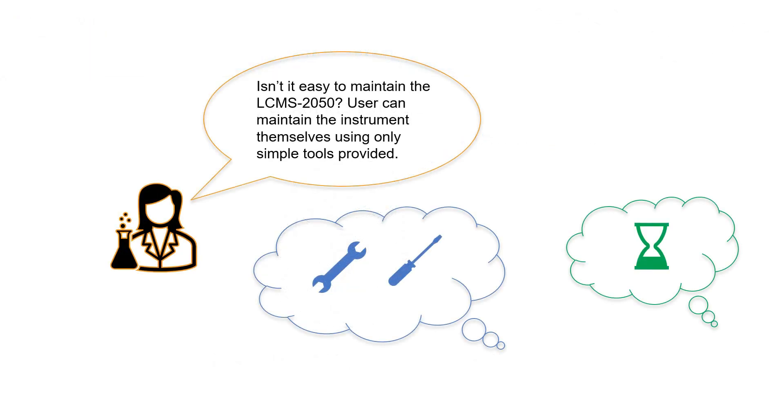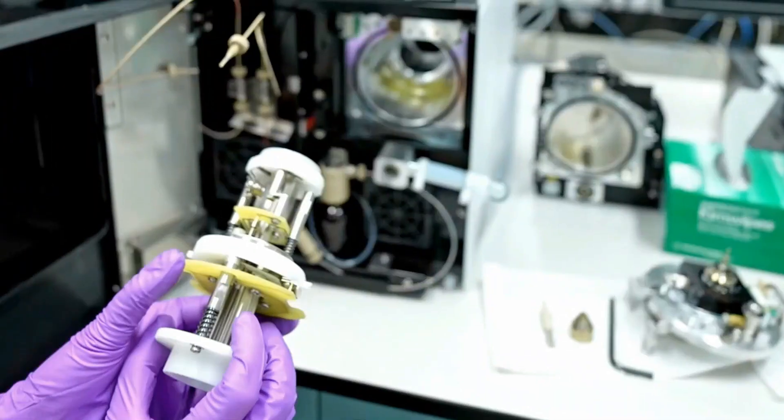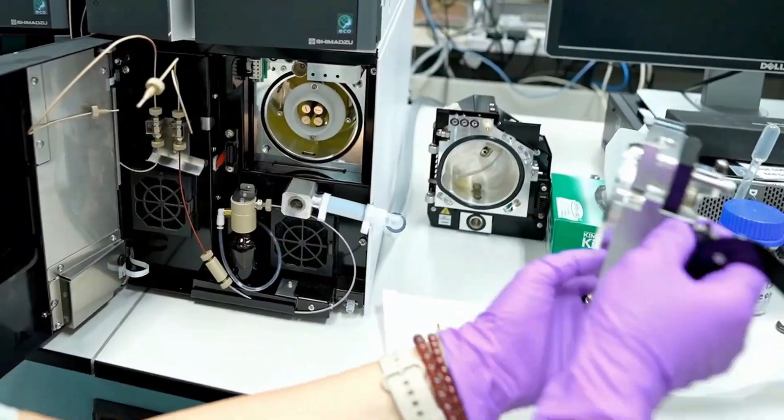Isn't it easy to maintain the LC-MS 2050? We can maintain the instrument ourselves using only simple tools provided. Stop the vacuum only when cleaning of the ion guide is performed. Start the vacuum after the maintenance. Now let's install back the ion guide and start the vacuum.